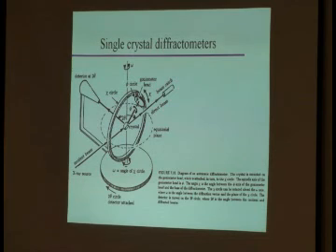You always have a beam stop. So what you really have is a whole bunch of rotational degrees of freedom. That is what allows you to image large parts of reciprocal space without having to move either your X-ray source or the location of your crystal. The crystal will still move. It's being rotated. The detector might move depending on your setup. The X-ray source stays fixed in this case.